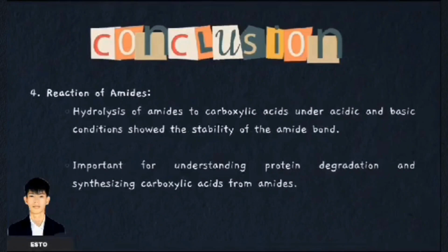Number 4. Reaction of amides. The hydrolysis of amides to carboxylic acids under acidic and basic conditions illustrated the stability of the amide bond and the conditions required to break it. This reaction is crucial in the context of protein degradation and the synthesis of carboxylic acids from amides.